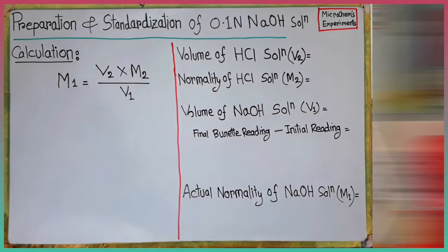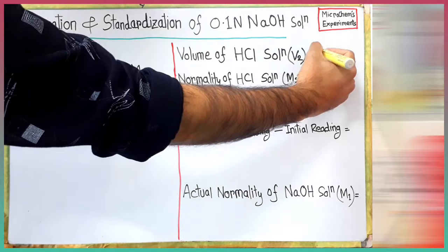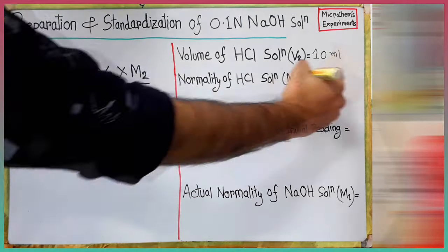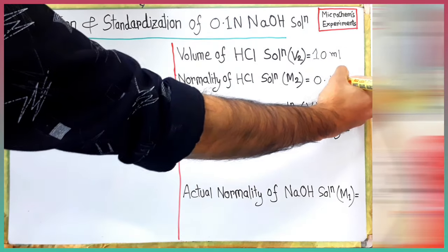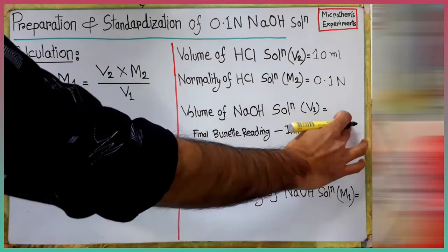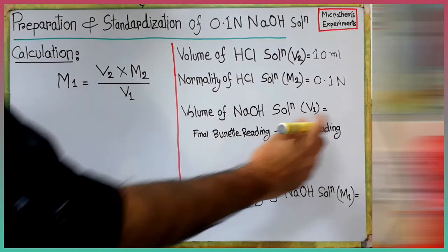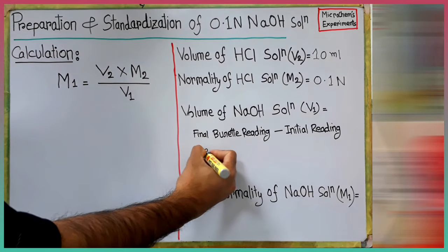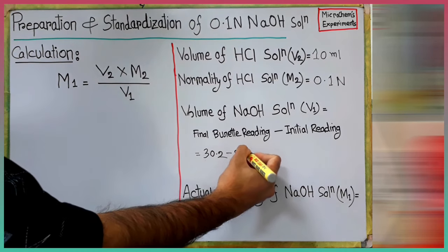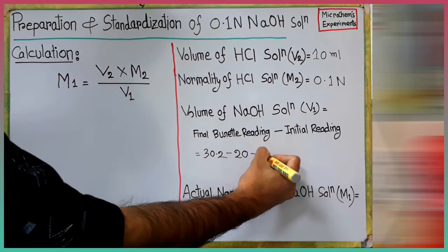We took 10 ml of standard hydrochloric acid solution in the conical flask during the titration. That's why V2 is 10 ml. The normality of standard hydrochloric acid solution M2 is 0.1 normal. Volume of sodium hydroxide solution used in the titration from the burette V1 is final burette reading 30.2 minus initial reading 20, which is 10.2.